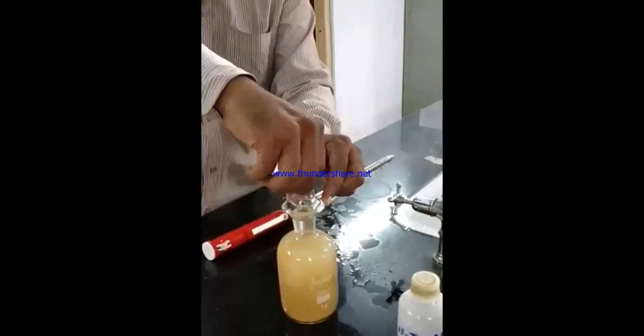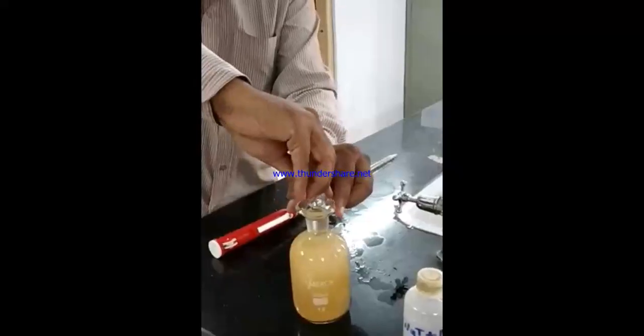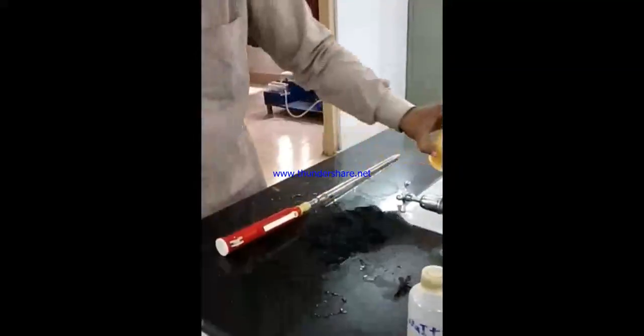Now you will see that a brown precipitate will be forming. Initially a total yellowish brown color will develop, and then we will leave it for 30 to 40 minutes. We will see that a brownish or yellowish brown precipitate is formed, which deposits at the bottom, and a clear supernatant liquid is formed at the top of this BOD bottle. We have mixed it properly, then we will leave it for 30 minutes.